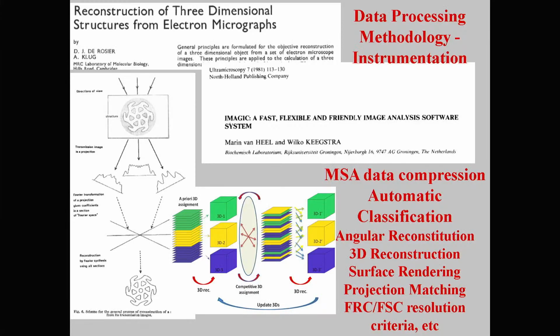And there were all kinds of further techniques that had to be developed here, like automatic classification, getting the angles, 3D reconstruction, surface rendering instead of cutting out balsa wood sheets. And you needed resolution criteria, all these things. So these things I have done later independently.